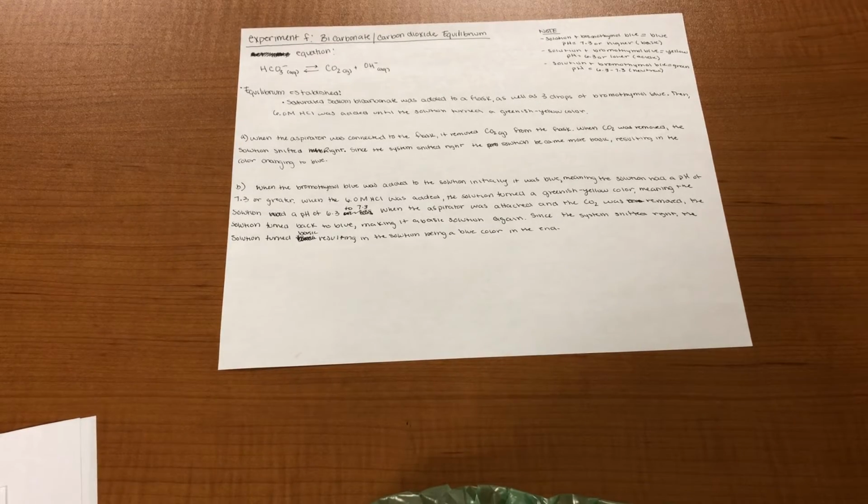Then, when the 6 molar hydrochloric acid was added to the solution, it turned a greenish yellow color, meaning the solution had a pH of 6.3 to 7.3. When the aspirator was attached to the flask and carbon dioxide was removed, the solution turned back to blue, making it a basic solution again. Since the system shifted right, the solution turned basic, resulting in the solution being a blue color in the end.